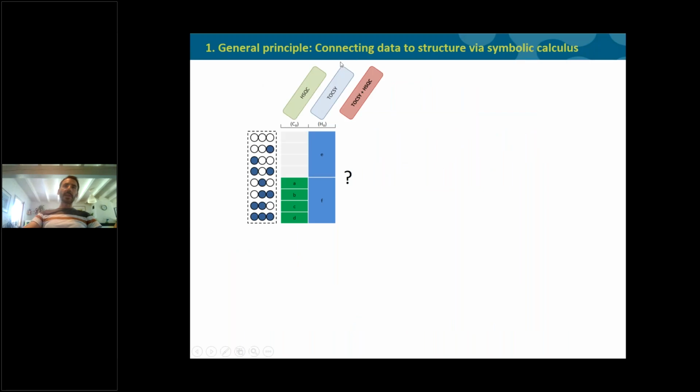So, for instance, if we want to integrate HSQC and TOCSY experiments, we can just set very simple relationships. For instance, this measurement A represents the isotopic species which is labeled only in position 2, so 0, 1, 0, relative to the complete set of species. And we can do that for all the measurements that are obtained by HSQC sequences.